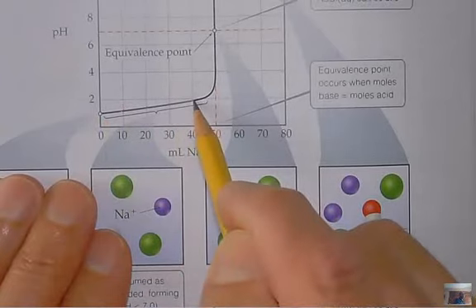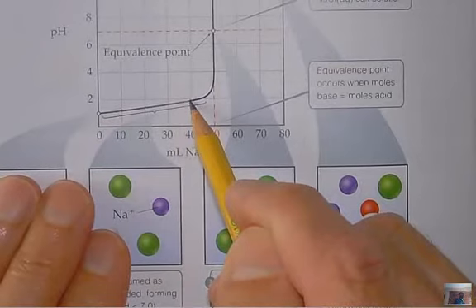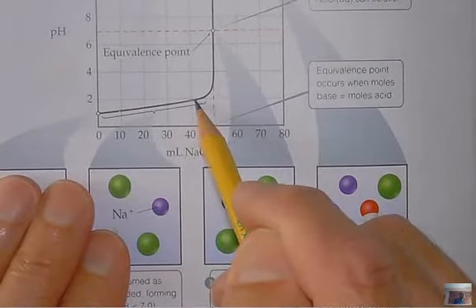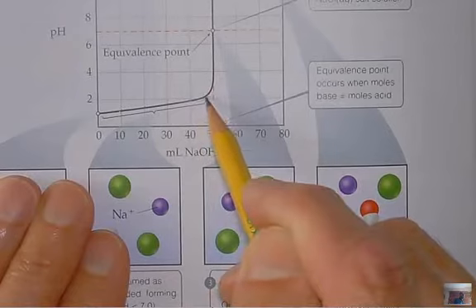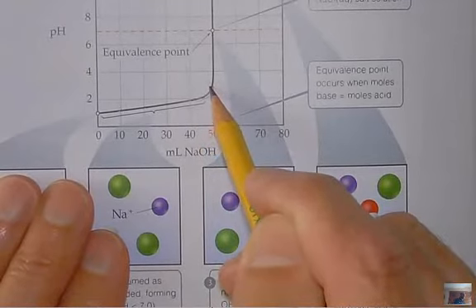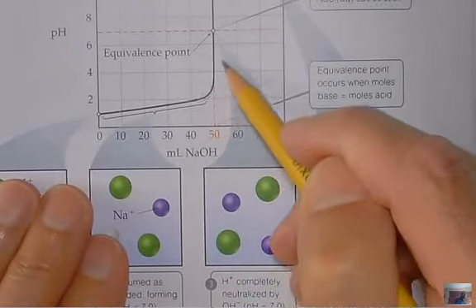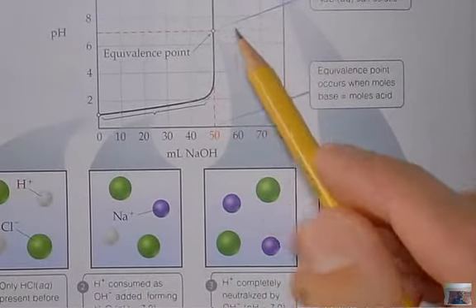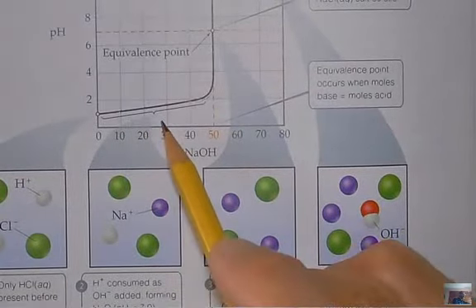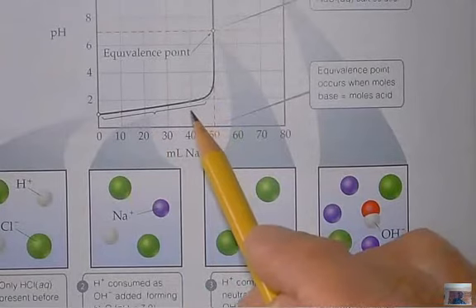Then it gets interesting. Once I start to get close to exhausting all of the acid in the solution, now my pH quickly takes off. So if I did 41 milliliters and wrote down the answer, 42, 43, 44, 46, 47, now I'm starting to get a lot of action. And then all of a sudden, boom, the pH will jump up. So you can go pretty quickly over here and open the stopcock and add a fair amount of liquid. But as you get close to the end point, and how do you know you're getting close? Because the pH starts to change.